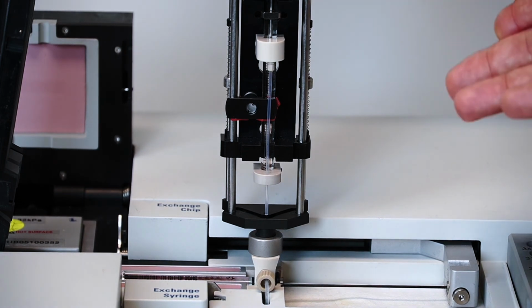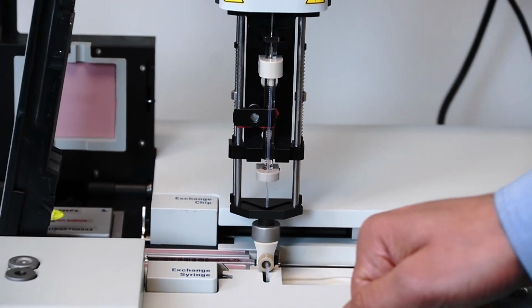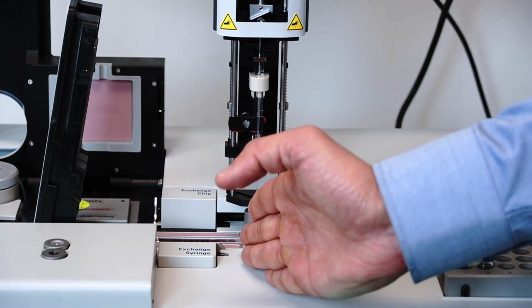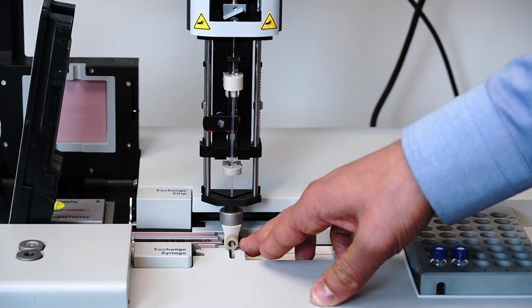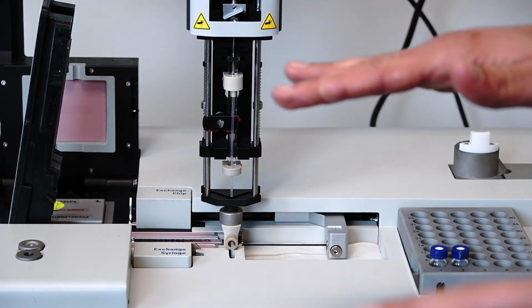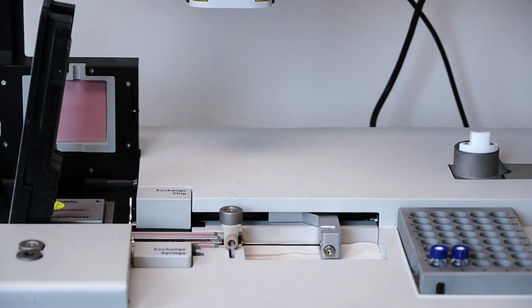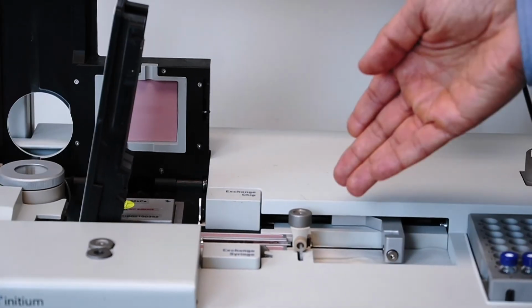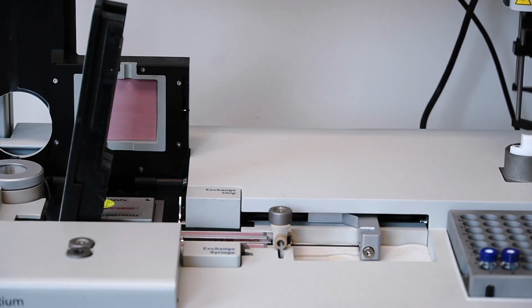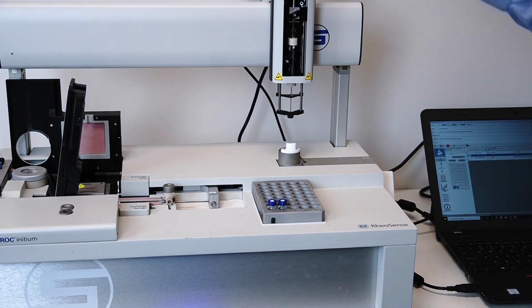Now that it's sensed that it has injected all the liquid into the sample, the pusher block is moving to push the piston of the test syringe past the opening in the injection port, so that it is now completely sealed off to the outside world. And now the auto sampler removes this auto sampler syringe from the injection port, and now brings it over to the wash port, where the auto sampler syringe will now begin the cleaning process.